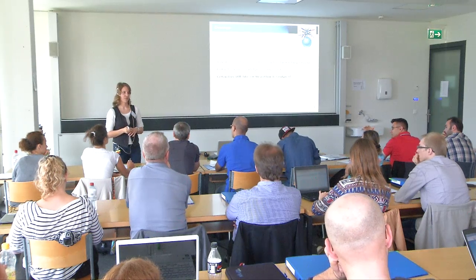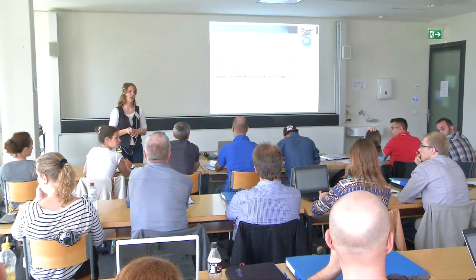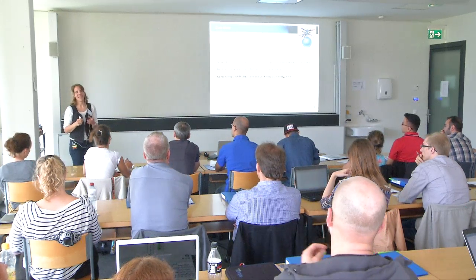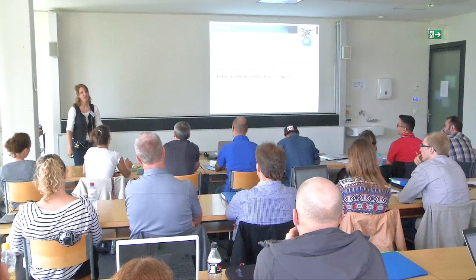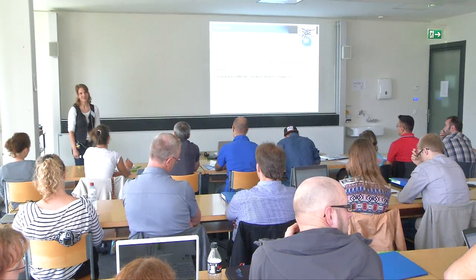Yeah, but then in my BLAST, I should replace all the I's with L's and do all combinations. Well, but this you would need to do already at the discovery phase, right? In a way. So this is a general question for discovery proteomics: how much do you trust your DNA sequence of the organism you're working with, and how wrong is it or not, right?